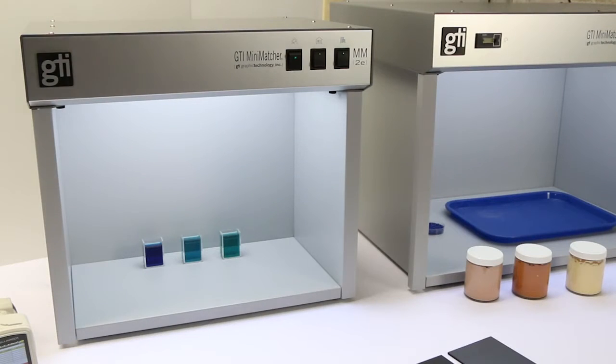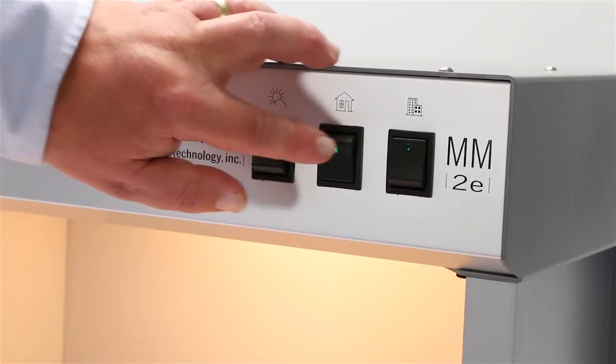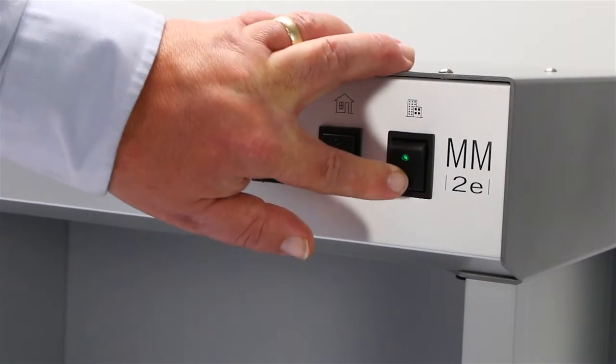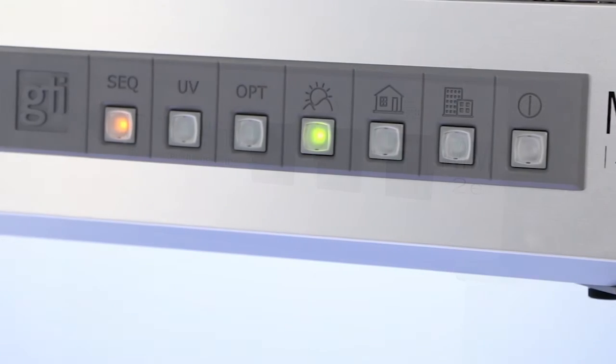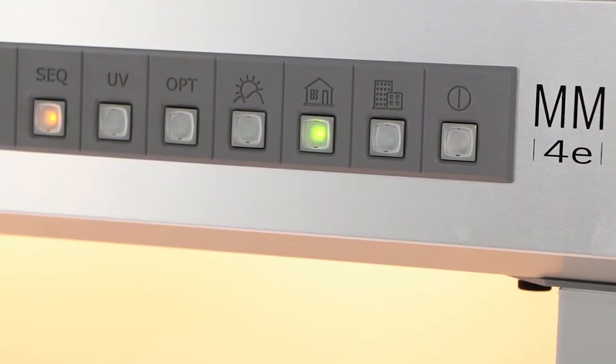Our mini-matcher series are compact and economical with up to five distinct spectral sources of illumination. They are easy to operate and can be set up in minutes.